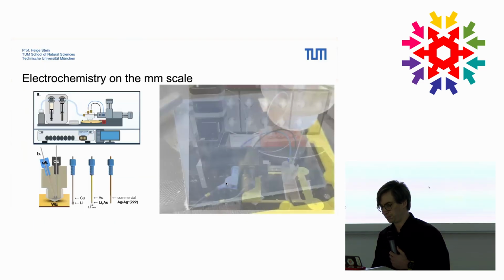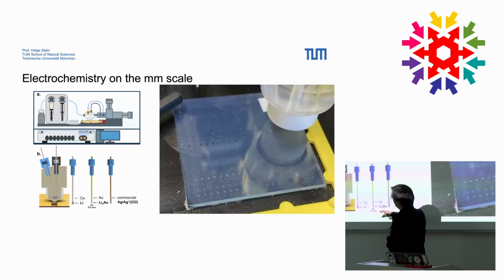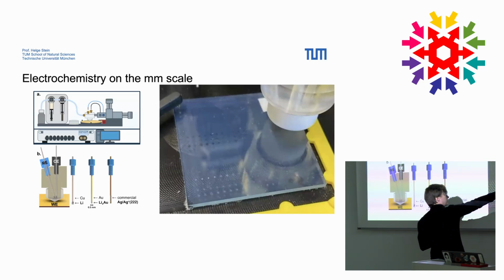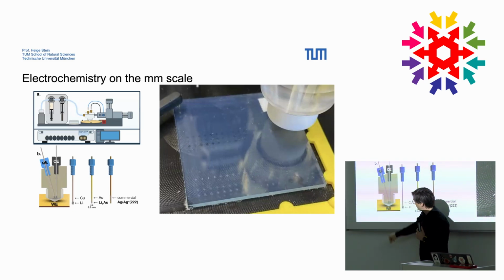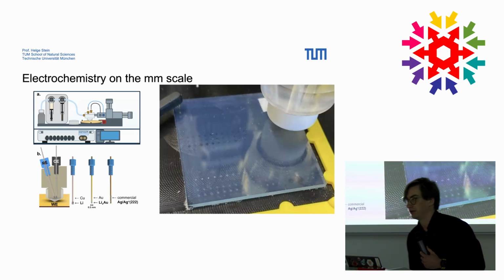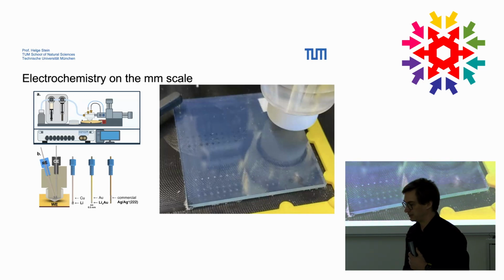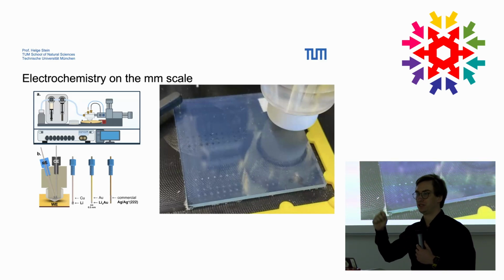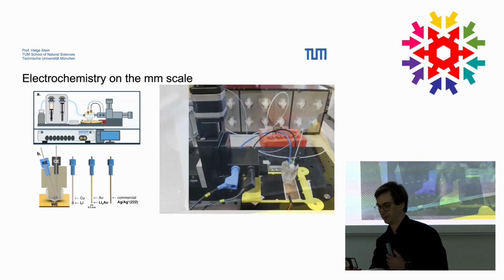The scanning droplet cell works roughly like this. You have a miniaturized electrochemical cell where you place your counter electrode in this small housing. So here you have a picture. The substrate is 5 centimeters big. You have a counter electrode, you have a reference electrode, and a very small volume for the electrolyte. You only expose about a millimeter in diameter of your substrate to perform an electrochemical experiment. What you can then do is sequential experiments, meaning every time your scanning droplet cell touches down, you can do a new experiment, you can exchange the electrolyte, and it's relatively cheap in terms of how much material you really use, and how much real estate in terms of a substrate you really need.